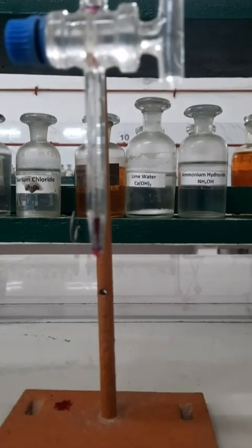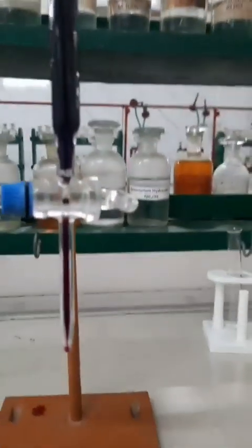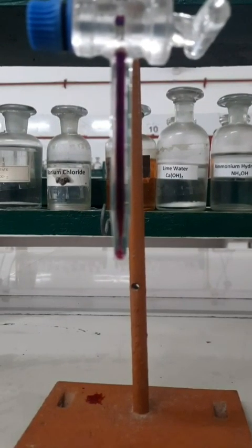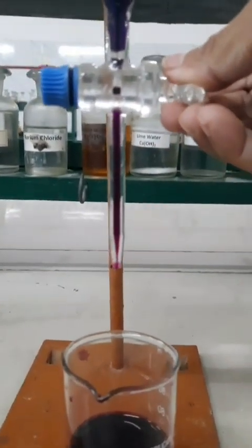Now I am adding potassium permanganate solution with the help of a funnel. Now fill the burette with potassium permanganate solution, and you have to remove the air gap from the burette. Then you have to adjust the upper meniscus of the solution at the initial reading, that is nothing but the 0 mark indicated on the burette.